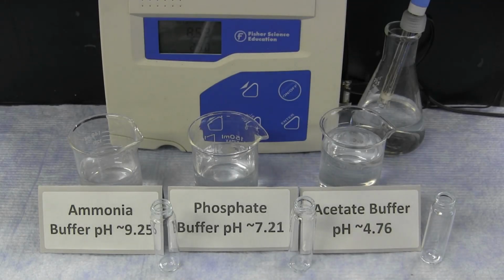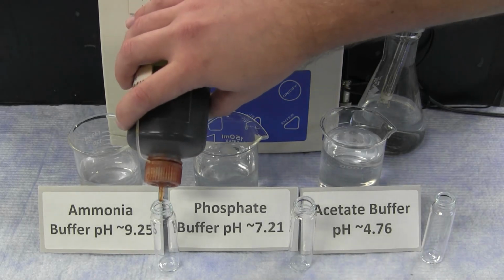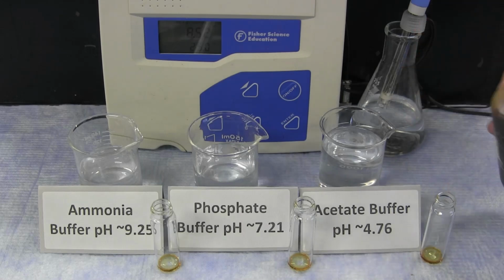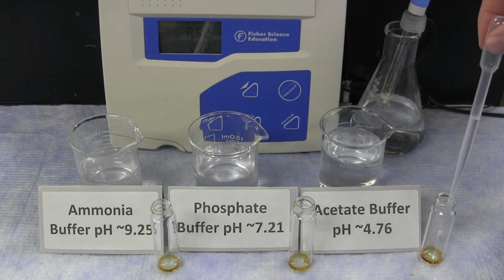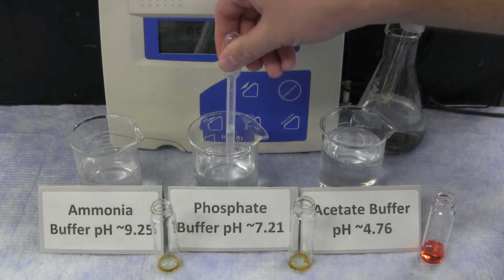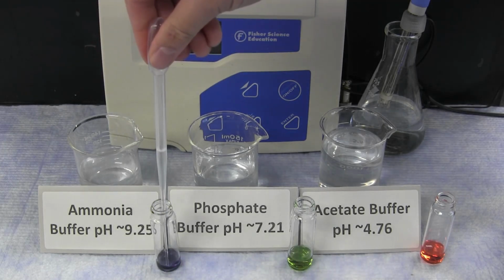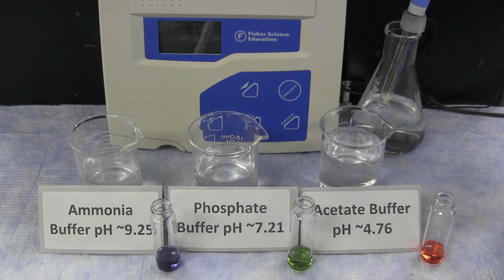The pH which the buffer hovers around is related to the pKa of the equilibrium reaction. The pKa value is the negative log of the acid dissociation constant, or the Ka, or in the case of ammonia, Kb. You can see with each of these different solutions that when universal indicator is added, the different buffers all create a different pH. With the acetate buffer indicating an acidic pH, the phosphate buffer indicating a neutral pH, and the ammonia buffer indicating a basic pH.